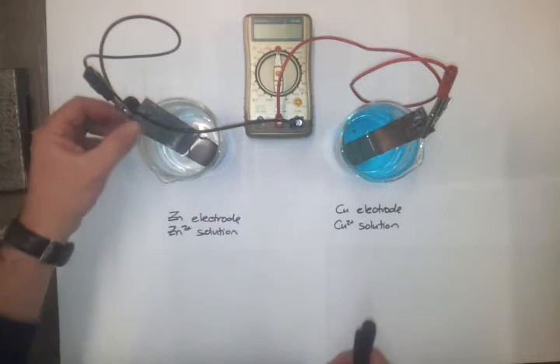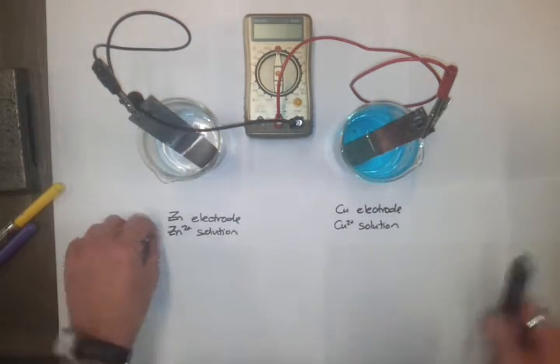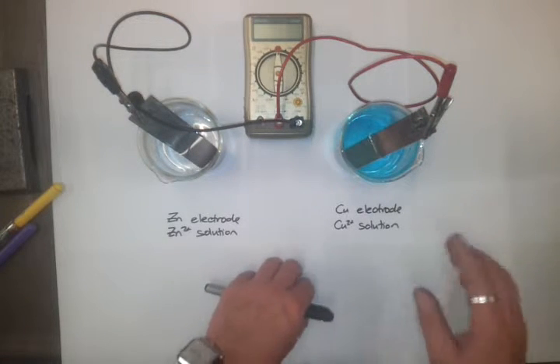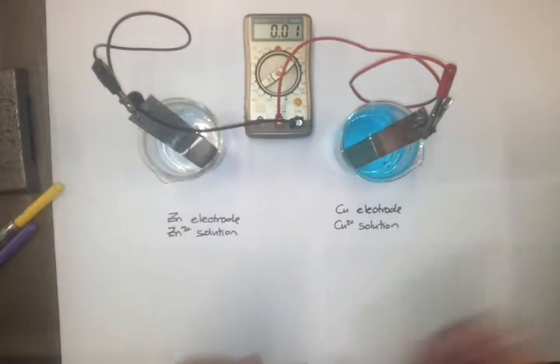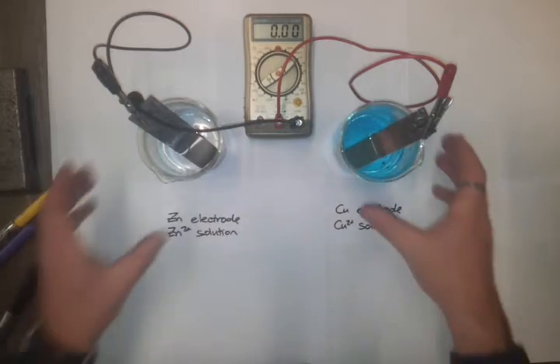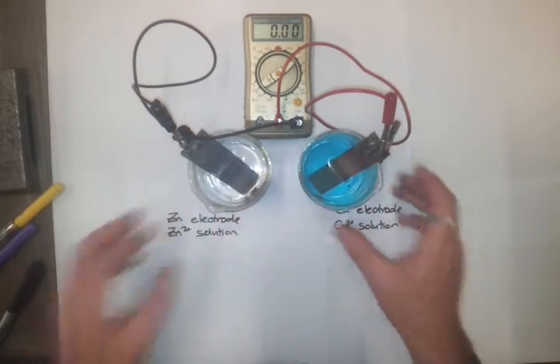Here we've got a zinc electrode sitting in a zinc solution, so no chemical reactions actually occurring at the moment. Here we've got a copper electrode sitting in a copper solution. Again, no chemical reaction is occurring at the moment. They're connected in parallel to a multimeter that I'm going to turn into a voltmeter right now, and we can see that there's no voltage created there at all. This is because the cells are not connected. They're only two separate half cells.